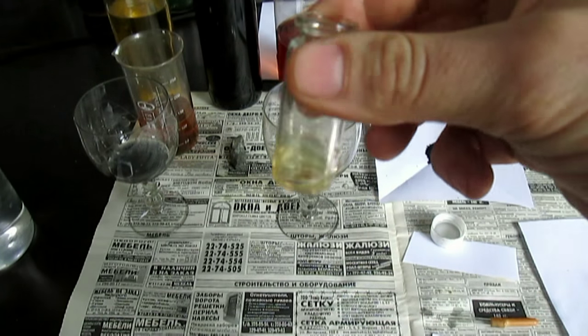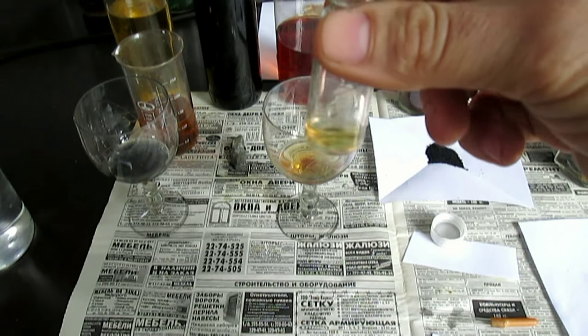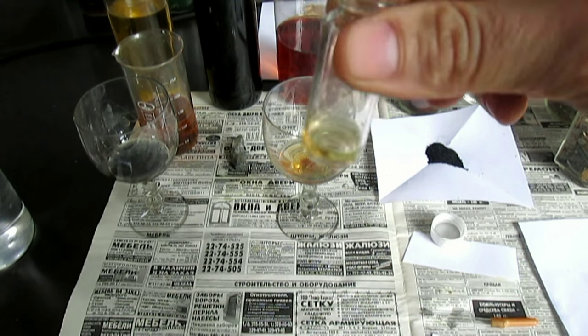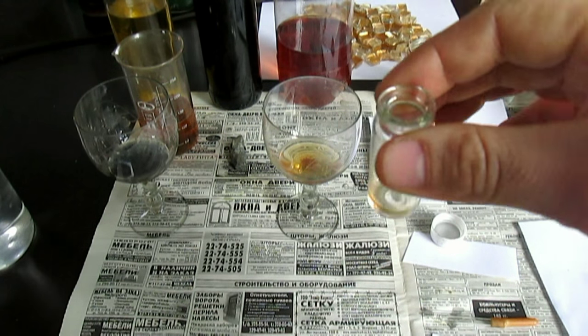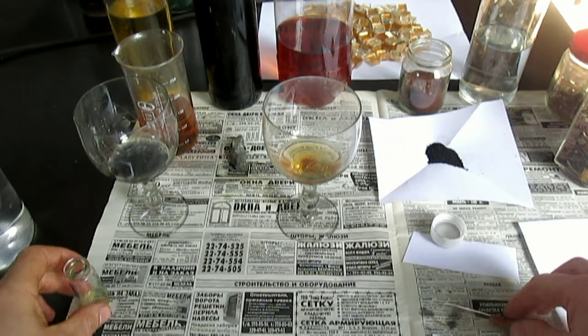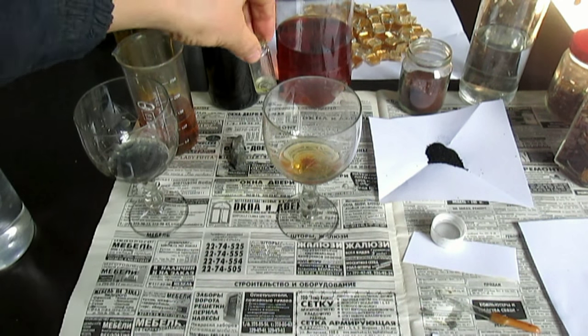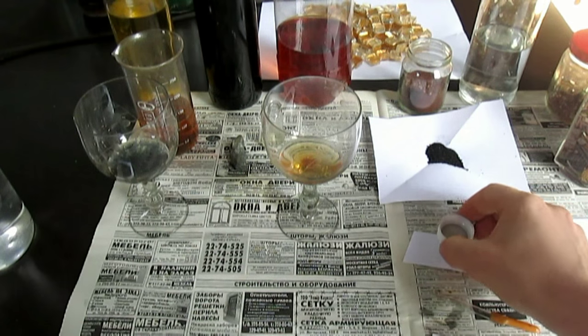Оно не выделит золото. Сперва муть выделяется, но если олова налить много — эта муть снова растворяется. Никакой реакции нету, но золото здесь есть. Так же и железо бесполезно сюда лить — ничего не выделится абсолютно. Никакой окраски даже не будет.